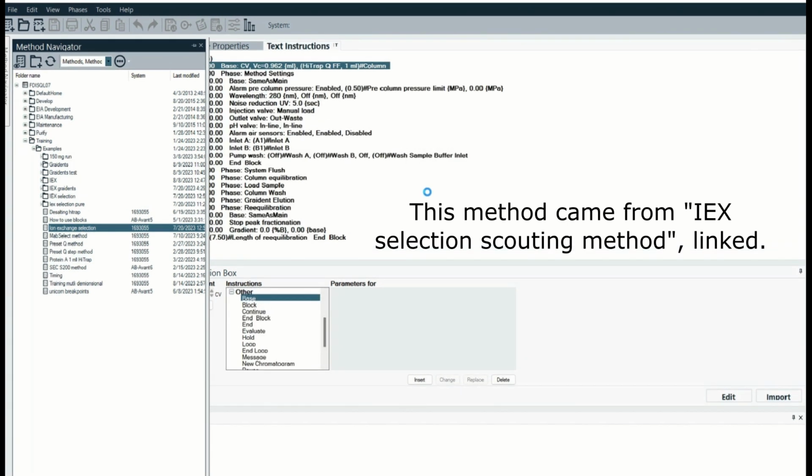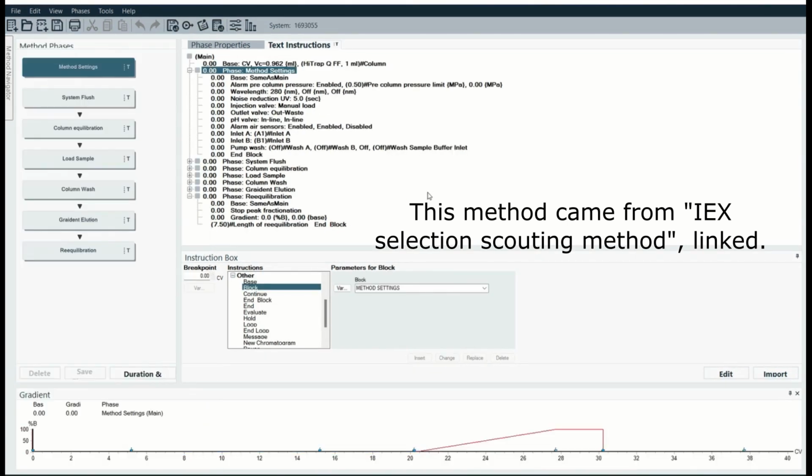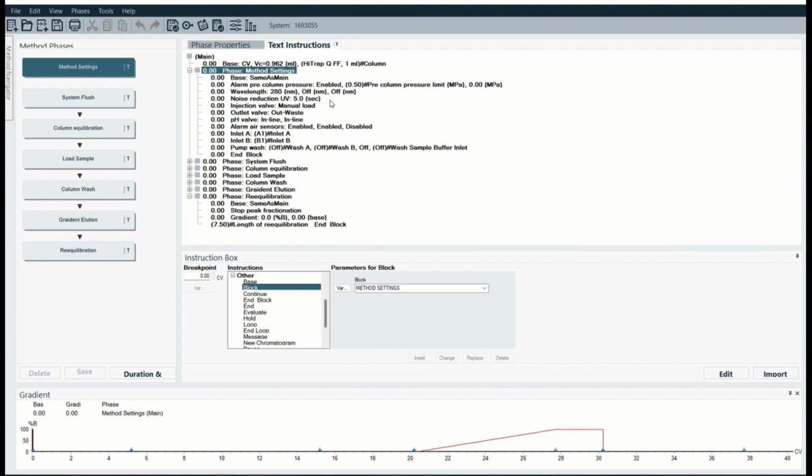Another couple things I want to say is that I will run this method, and then we'll do this method together, put together all the scouting and start protocol information, and then after that, I will test it myself on my own system and make sure it works.